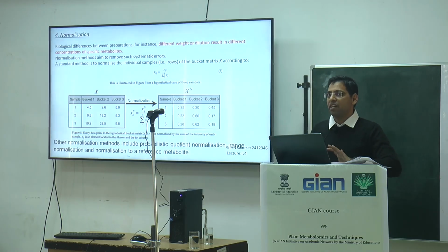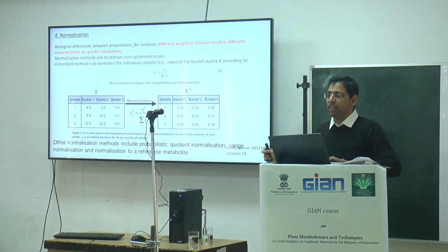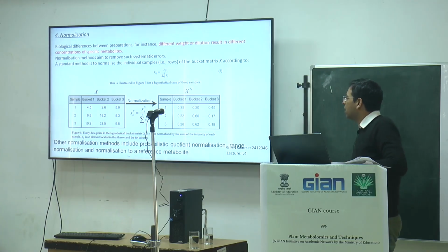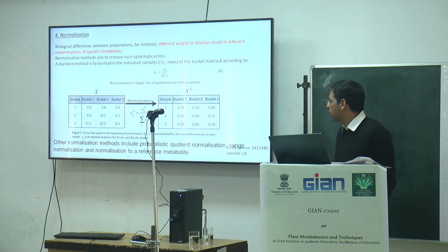So normalization is a tool used in LCMS and NMR also. When I explain LCMS, you will see normalization is used there as well. This equation gives the standard method to normalize the individual sample buckets, because different weights and dilutions result in different concentrations of the specific metabolites.